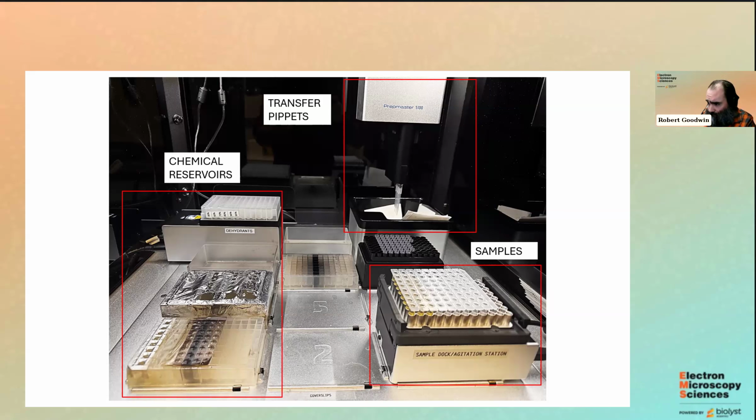It's not in this picture, but I have another plate like this that has round wells in it that the cover slips sit in. For those, I don't agitate, because obviously I don't want to shake them off. So in my protocol, instead of my sample area being on the agitation station, my samples are just in the number 2 slot.